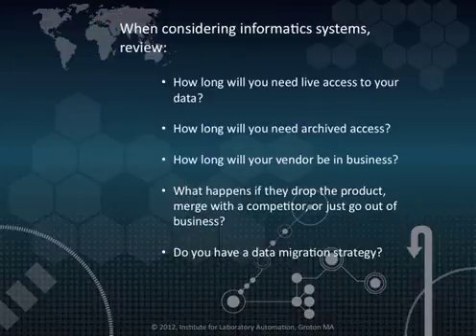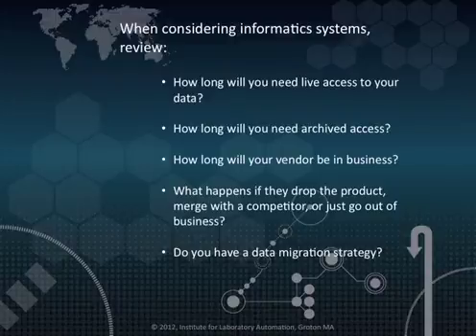When considering laboratory informatics systems, there are other points that you need to review. How long will you need live access to your data? This may have an impact on the type of technologies that you use for implementation, including backup strategies. How long will your vendor be in business? The laboratory market has seen a lot of mergers and acquisitions, and these can put product maintenance and support strategies in jeopardy. This is a particular concern if you're considering all-in-one product strategies. Do you have a data migration strategy? If a product is upgraded or replaced, can you extract the data and move it easily to a replacement system, or is this going to jeopardize the operations of the laboratory?